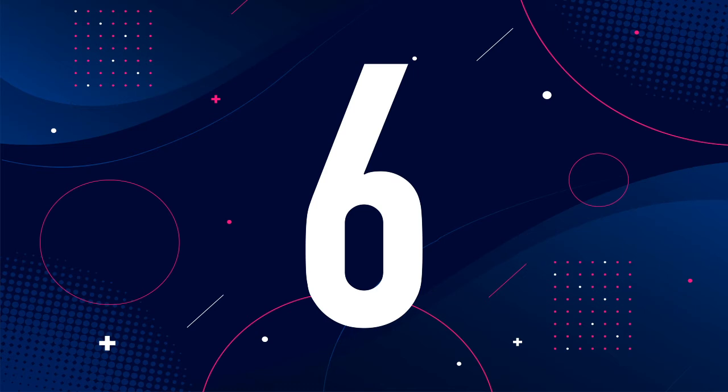Yes, that purple reddish color. Thank you. So if we look here, it's a magenta pink or a reddish color. Excellent. And then my background cells are going to be that blue color. Excellent. What color would a gram-negative cell be after a gram stain? Pink. Excellent. So we have our negative pinks.